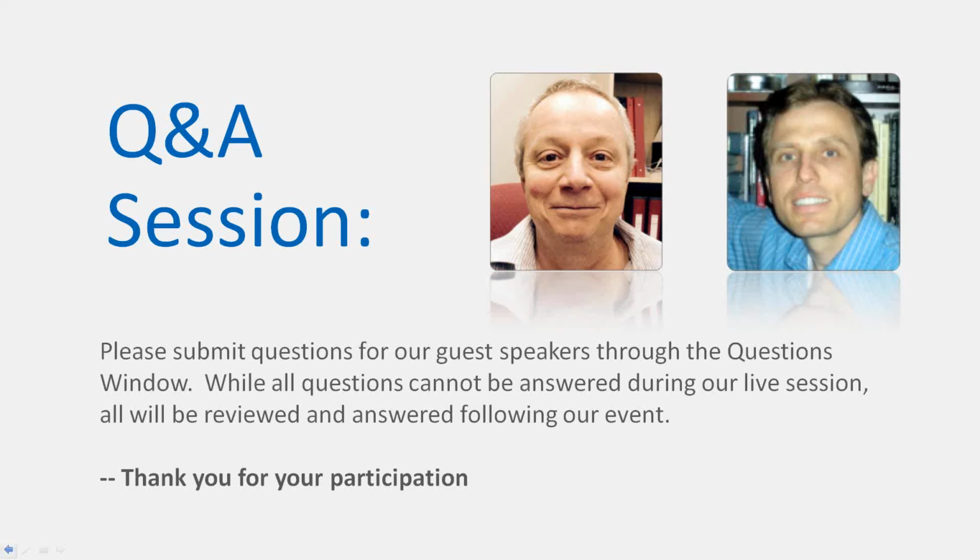Perfect. And actually, that's right on point. I'm watching our communications window grow with votes from people here online, and for the most part, isoflurane is the major response coming in. Obviously, people have stressed in some cases, we're doing a dog study, and there's maybe some combination of injectables as well, or maybe they're using sevoflurane. We've seen a couple of those. But great to have everybody.